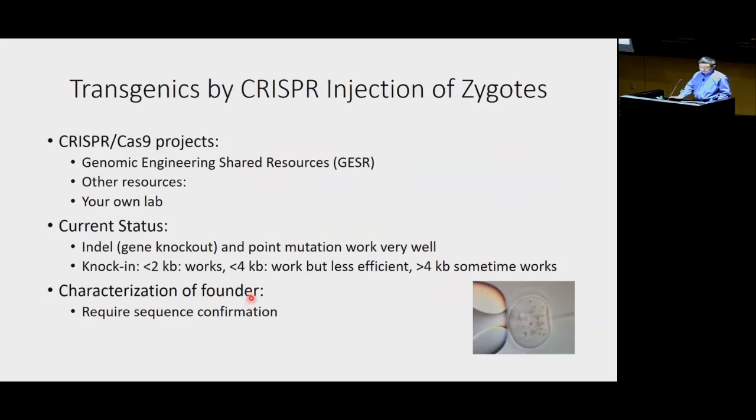The second issue is that when you're creating mutant mice using the CRISPR approach, you may need to put more effort into characterizing the founder, because you may introduce point mutations you cannot tell by simply genotyping with PCR. Initially, you can use PCR to screen all the mice you got. But once you have some potential candidates, you do need to confirm by sequencing.